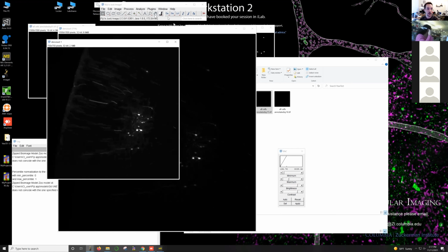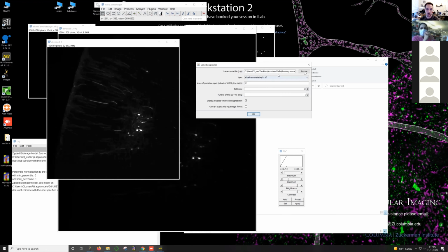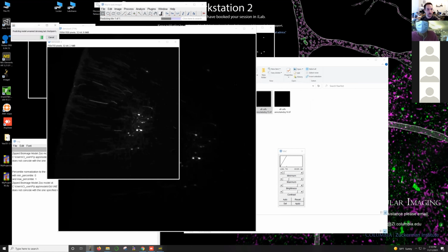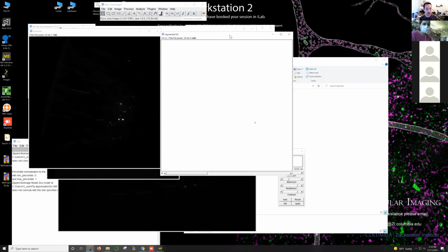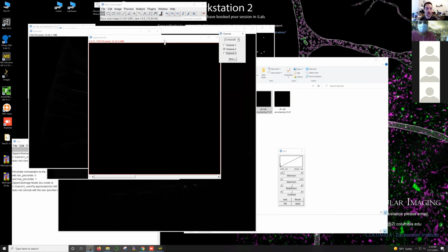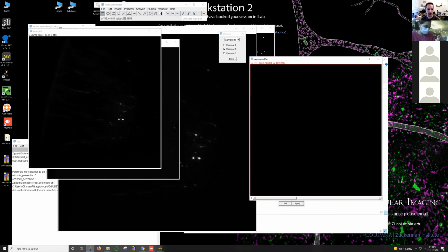But what about if I use my network that I've trained on this exact problem? So I'm using the same network, I'm just selecting this image that I just made. And hopefully what should happen, I should get a pretty poor result. I'm hoping this will be a good illustration of why you wouldn't want to do this, because this network's been trained on data from a different scale. It's not detecting any cells. Even though to us those images look very similar, to the network they're completely different.